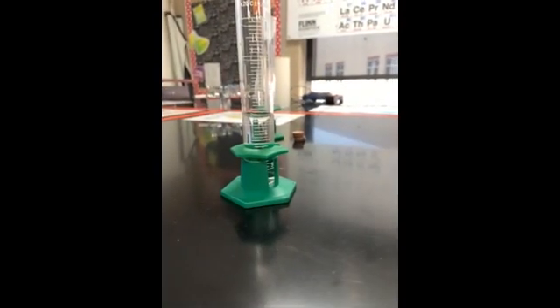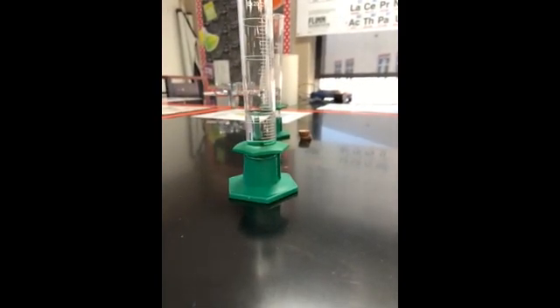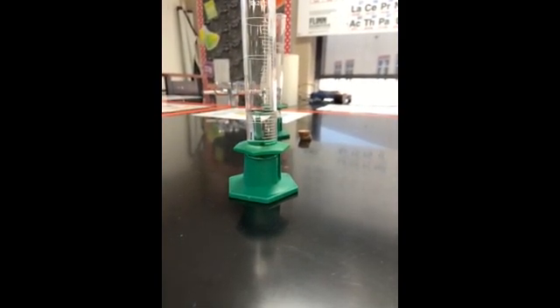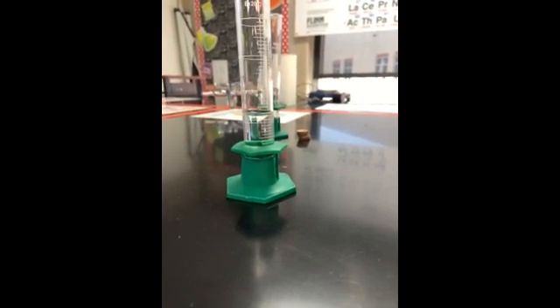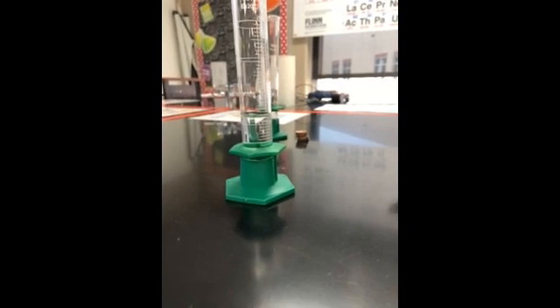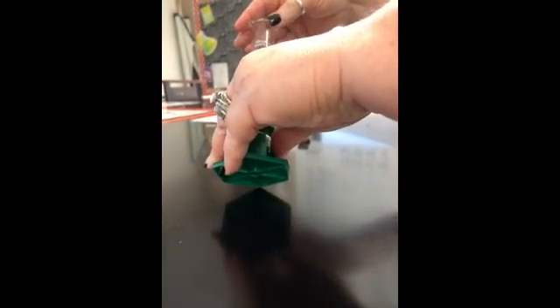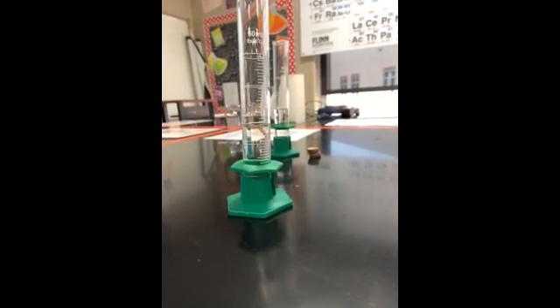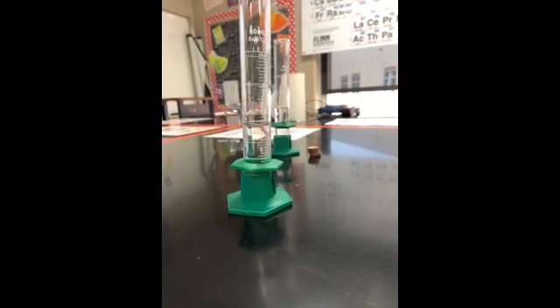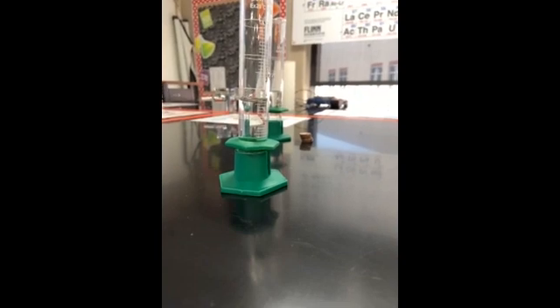All right. Trial 3, we're going to start at 21.20. Tip the graduated cylinder. And now we are at 26.00. Looks like right on that line for me.